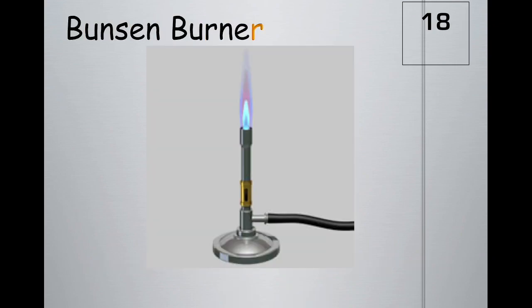This is the Bunsen burner, which is the fire source. It's used for heating. And so if you've ever asked me sitting at the desk in the science lab, what are these weird looking things on my table, this Bunsen burner, the cord would go into those strange two metal prongs that stick out on the table, and that would supply the heat, the gas, for this Bunsen burner.